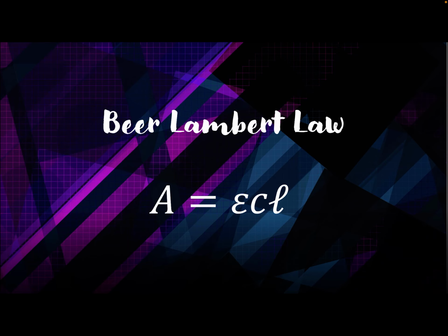It's important to zero the spectrophotometer before you start measuring absorbance because failing to do so results in incorrect readings of absorbance.